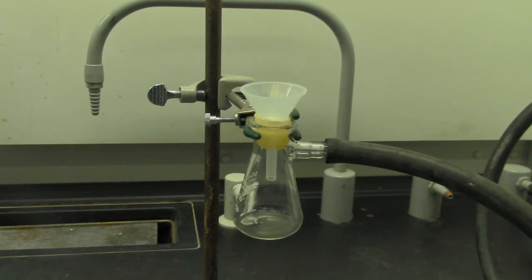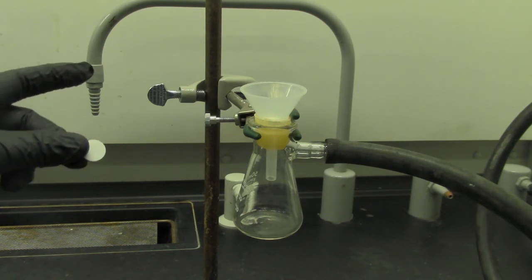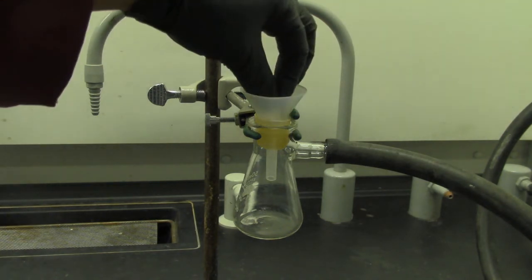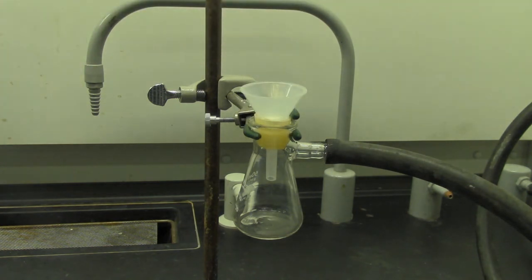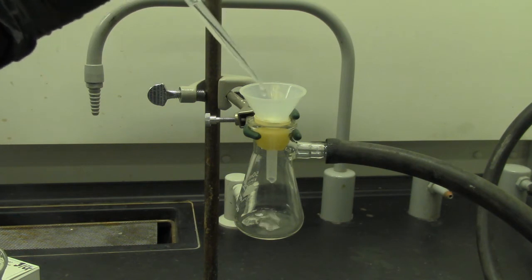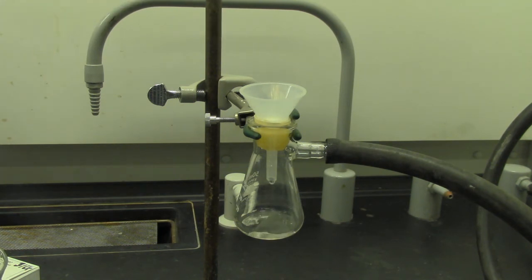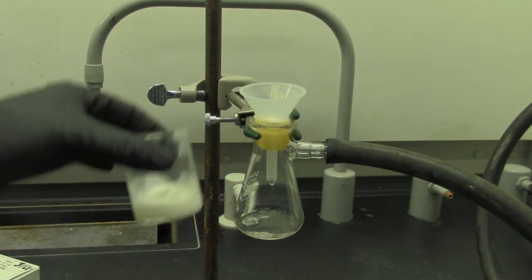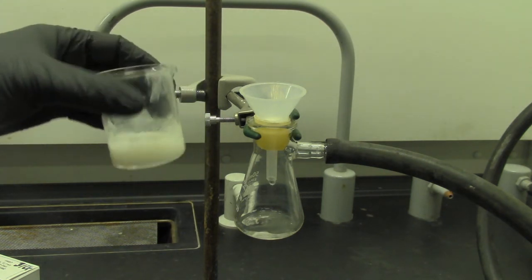So I'm going to collect the solid benzoic acid using vacuum filtration. So I have a little filter disc here, right? Filter disc put into the funnel here. Right, I'm going to turn the vacuum on. Okay, and wet the filter paper a little bit with ice water. And you pre-wet it. Okay. Now here's my benzoic acid, right? I'm going to filter this solution.